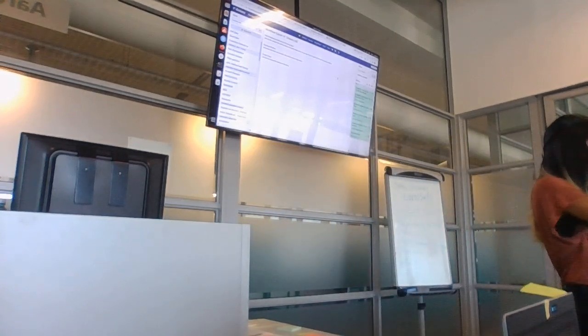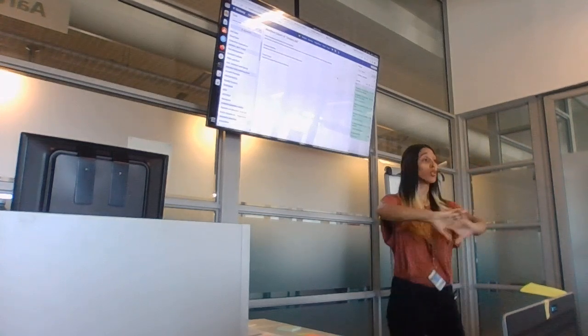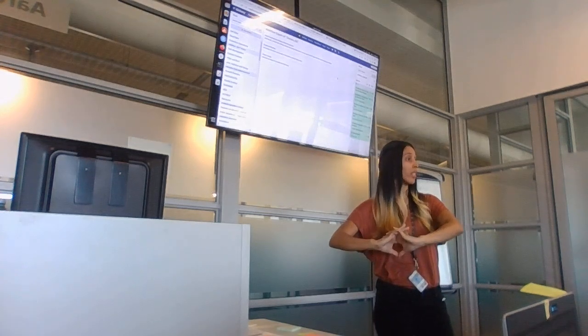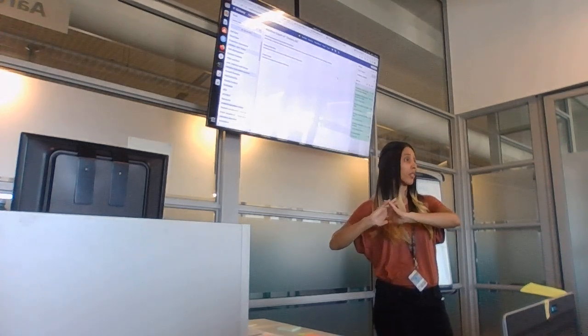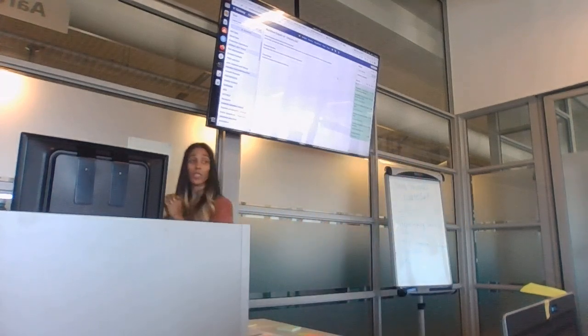I just want to show you that, remember I said earlier, if you're brave enough, you can publish your workflow, and you laughed at me. There are people who are braver than us. They have published their workflows, and we can actually import their stuff. Hopefully we'll get to that confidence level.